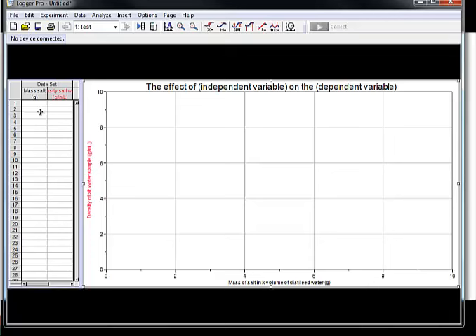Now, having said that, let's be clear. When you're writing in your lab logbook, you have to write in pen. And any mistakes you make, you never scribble it out. You don't use whiteout. Okay? You don't tear out pages. If you make a mistake, you draw a single line through the error and then write in whatever the correction is. You with me?